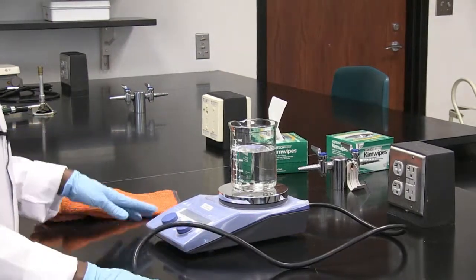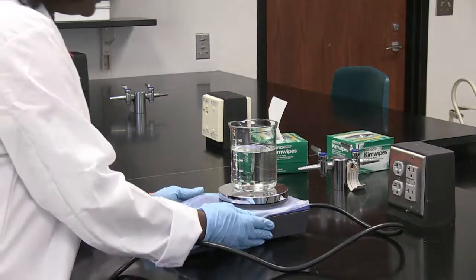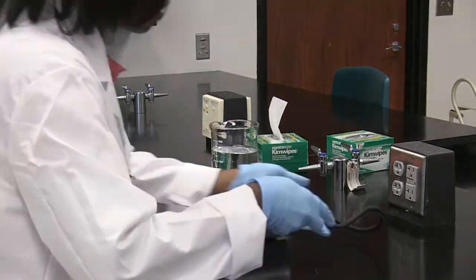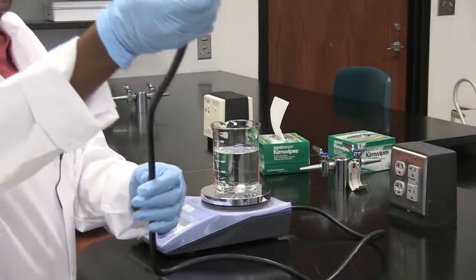In this case, I'm using a hot plate as an example. Before you use this equipment, check the cords and make sure that you have no frays or exposed wires.